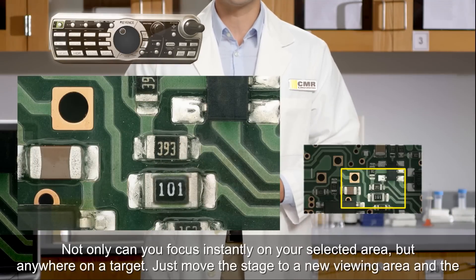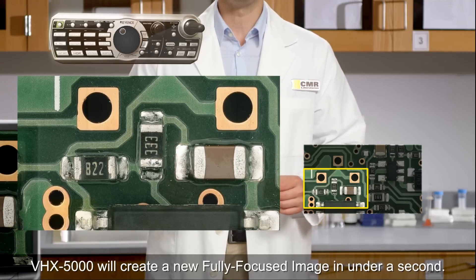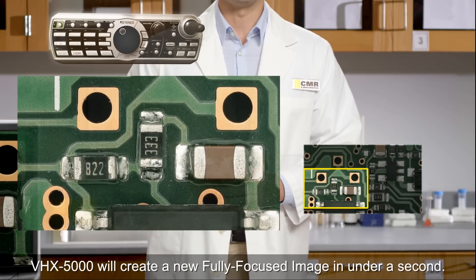Not only can you focus instantly on your selected area, but anywhere on a target. Just move the stage to a new viewing area and the VHX5000 will create a new fully focused image in under a second.